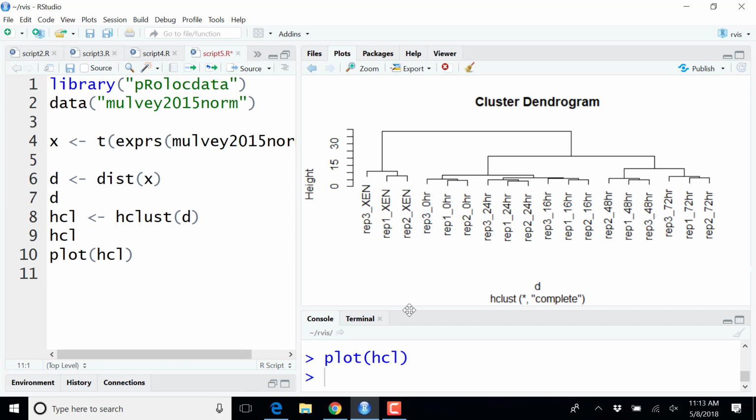And we have this cluster. The next thing we want to do, now that we have this tree, the dendrogram, is to identify clusters. Which ones do we want to group together? Something a little bit more formal than what we have done here by looking at them and circling them. And this can be done with the cutree function. So hclust is my tree.